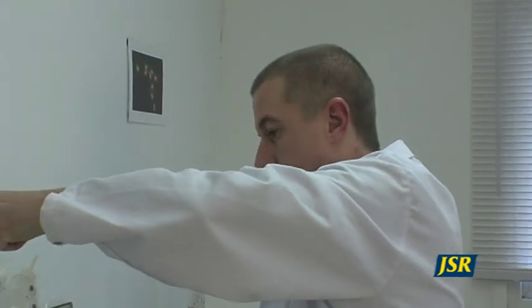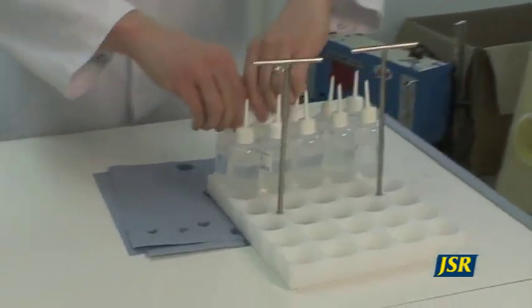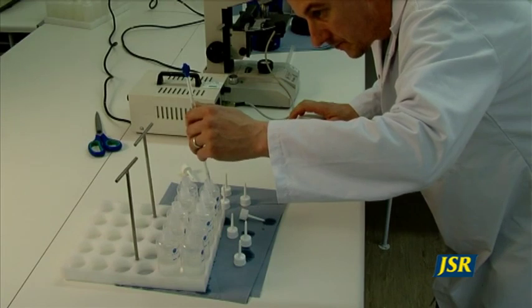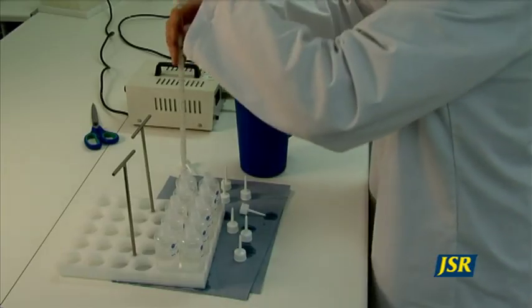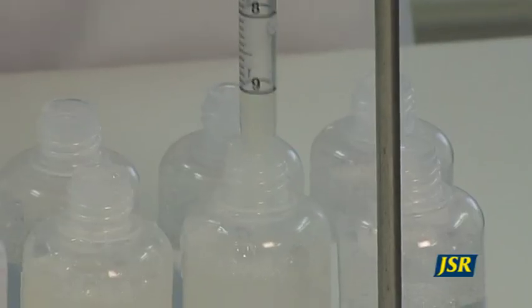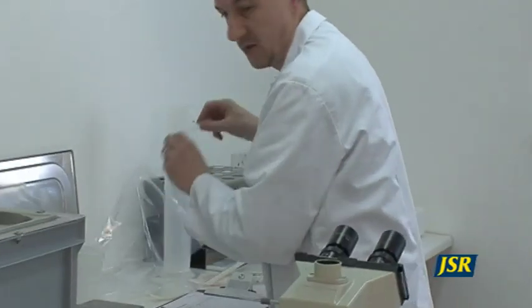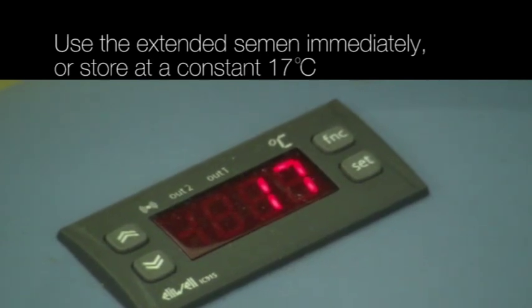An alternative method for on-farm collection offered by JSR is the Ultimate Package, whereby JSR delivers ready-made, premixed and measured dosage bottles direct to your farm. These are warmed prior to semen collection at 34 degrees centigrade, and the next simple step is to add 15 millilitres of fresh semen to each bottle. In all cases, the semen should be rechecked under the microscope to ensure it is alive and moving. The semen is now ready for insemination and must be stored at a constant 17 degrees centigrade in a cool locker.